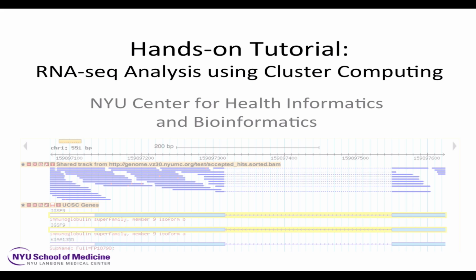As for stranded sequencing, is the cost much more, I expect, because you have to sequence both ways, right? Actually, no. You can sequence just a single strand, because the method itself will identify that every read you get came from the original strand that originated the message, because you're using dUTP and then getting rid of that strand.